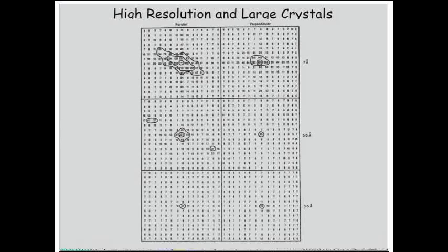And this just shows the output for some spots at different resolutions, parallel and perpendicular to the tilt axis. And you can see at low resolution, that spot splitting manifests itself as a kind of stretching of the spots. As you go to higher resolution, you can actually see those little wings. So here's that central peak that's been corrected, but you can still see the wings that you would expect. And then at very high resolution, those wings are so far out that you don't see them.